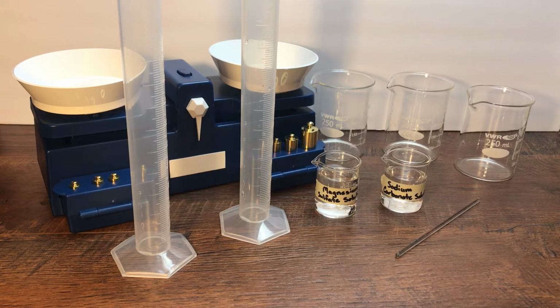I'll show you one way to do this, but there are actually lots of different procedures you could follow to explore the same question. So in order to determine the mass, we need to collect data about the mass of the two reactants before they are combined, and then collect data about the mass of the substance after it is combined. So first, let's find the mass of our two reactants, magnesium sulfate solution and sodium carbonate solution. We're going to use the balance to do this.